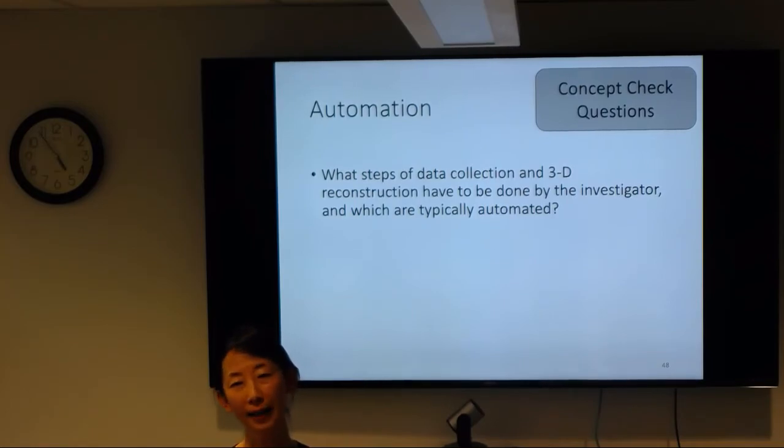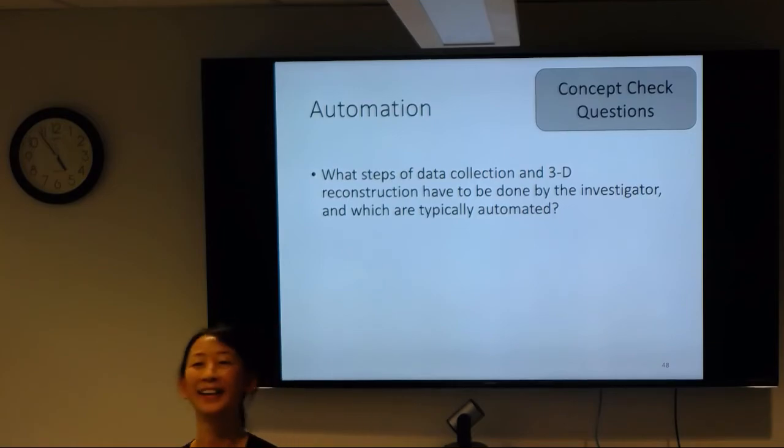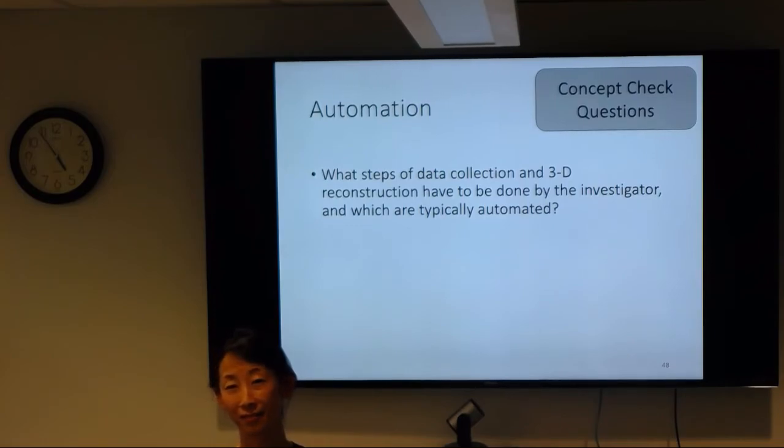Okay, semi-automatic. If you get Vitrobot, it's totally automated from your perspective. The new commercial version is very automated. It'll put grids in grid boxes for you after it has frozen them. That's actually really nice, because many of the grids were damaged at that step, when you grab it and want to put it in a small slot in the box. Many of the grids were bad that way. Some of them attach to the tip of your tweezers, and you just cannot get them to drop into the box. But that's nice. So currently sample preparation is semi-automatic, and you have the grid.